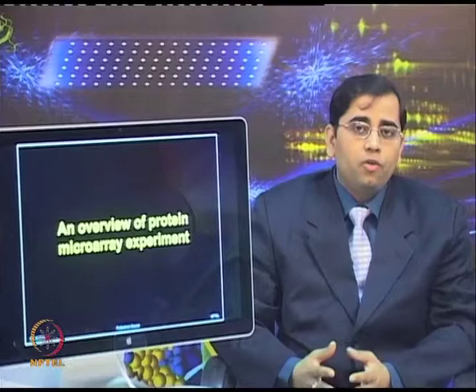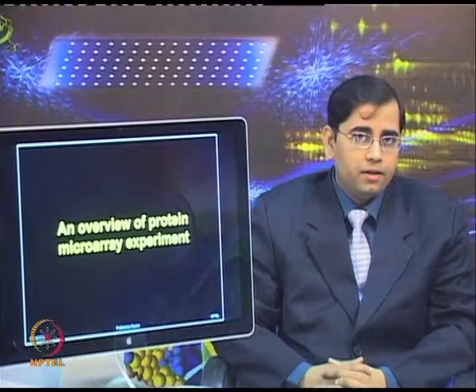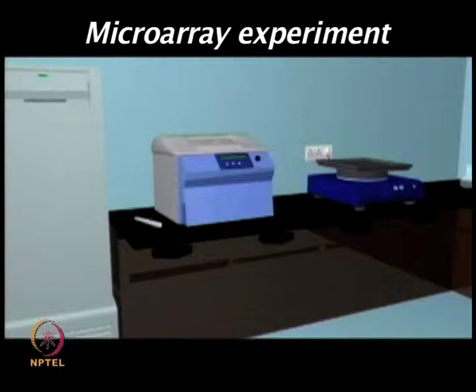It means, in general, I will show you an overview of the various steps involved in performing a protein microarray based experiment. I will show you how human proteome chips can be used for screening biomarkers by using human serum. Now, as I mentioned, the same overview, the same steps, can be performed for various types of applications.